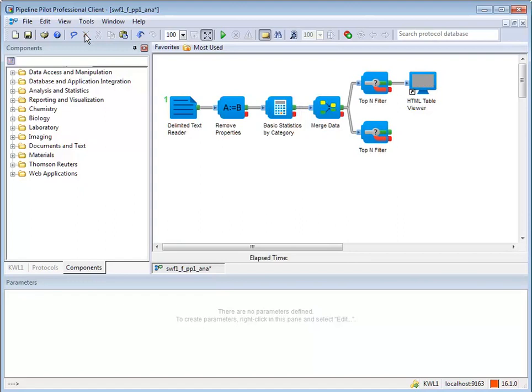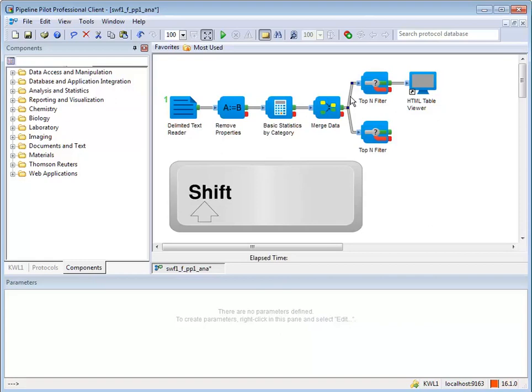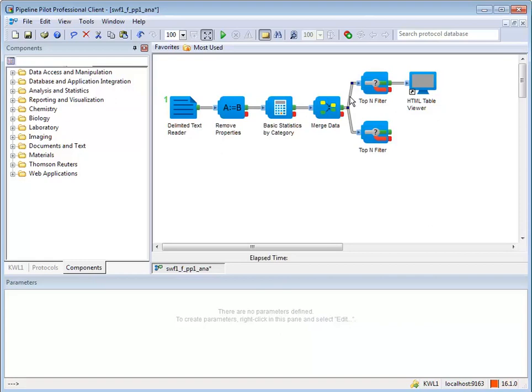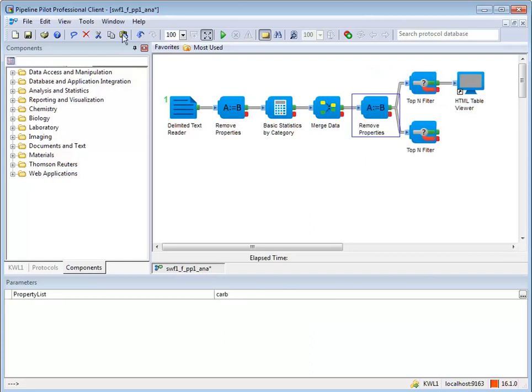If the two pipes in a branch are selected, which can be done by clicking on one and holding down the shift key while clicking on the second, the component will be pasted before the branch.